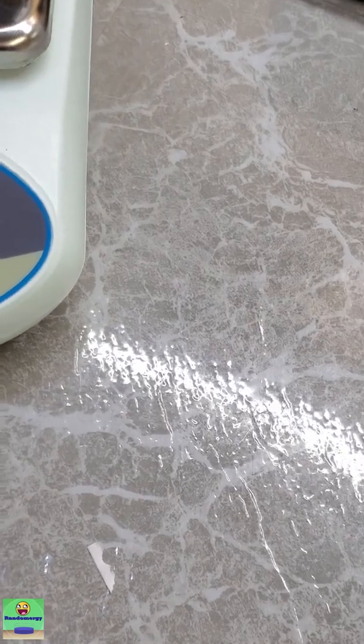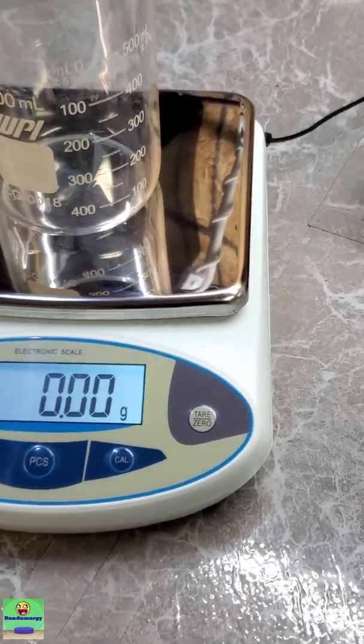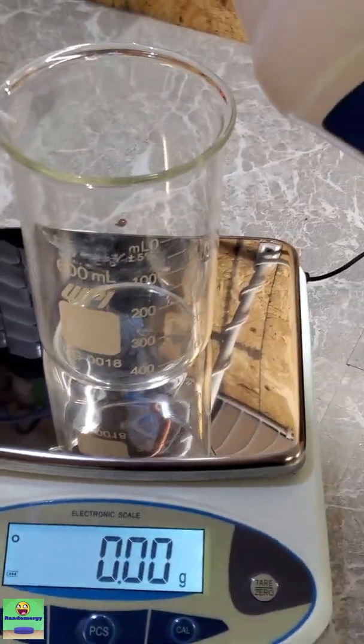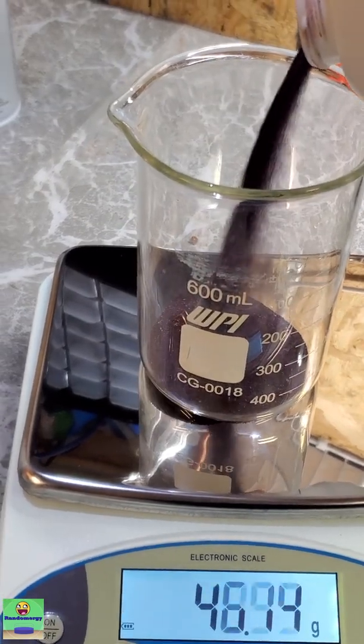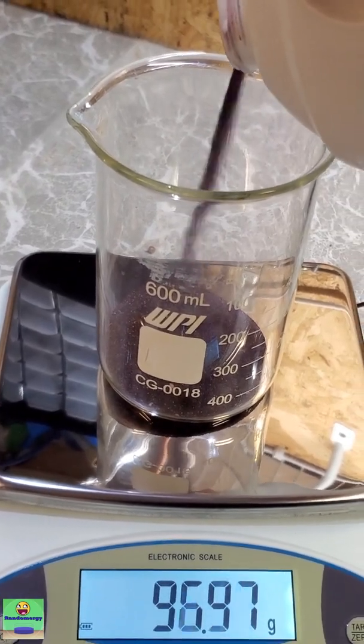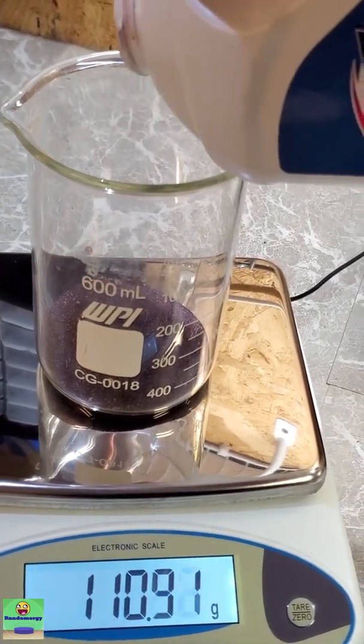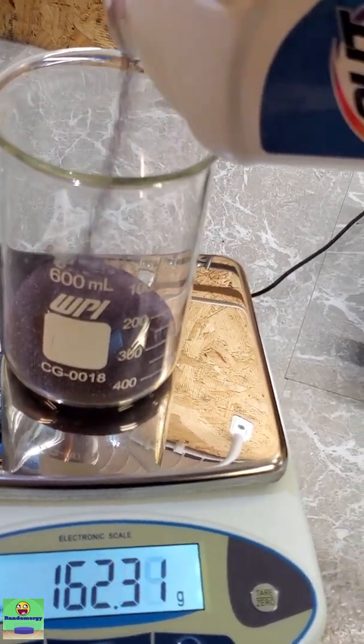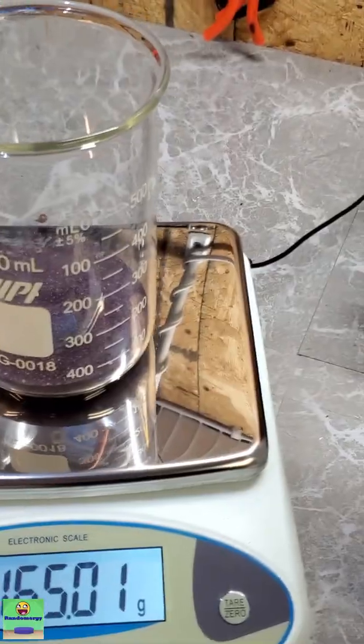First thing we got to do is tare out this scale with this beaker on it. Good. Okay. Now I'm going to measure out the 161.75 grams. So I'll just pour this in potassium permanganate. It's actually a pretty dense powder. So it doesn't take as much as you'd think. At least I don't think so.